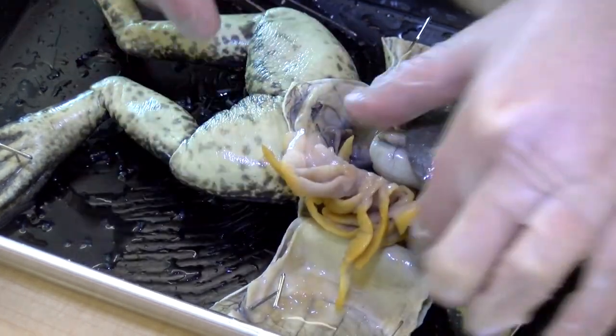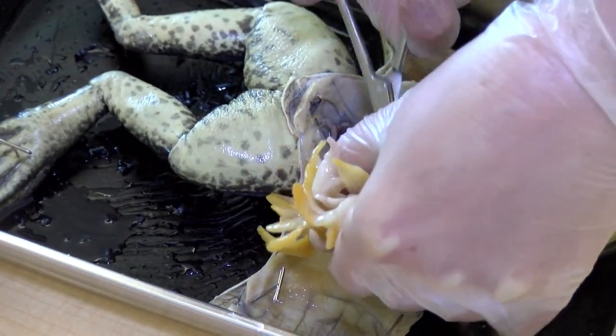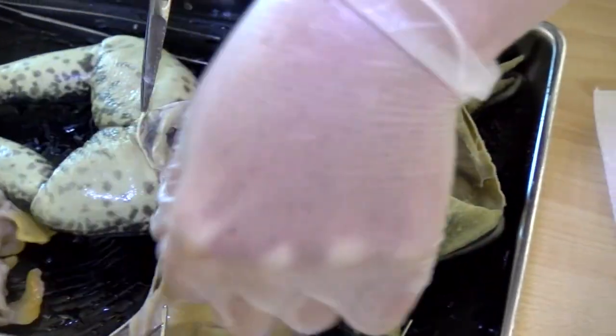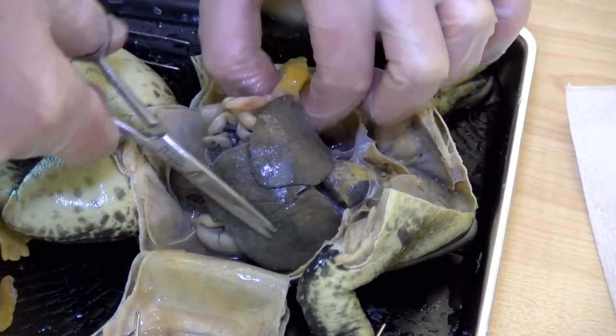What do those fat bodies do? I'm not entirely sure — they're just fat. They may help keep the frog warm. We don't have those, right? I don't think so.